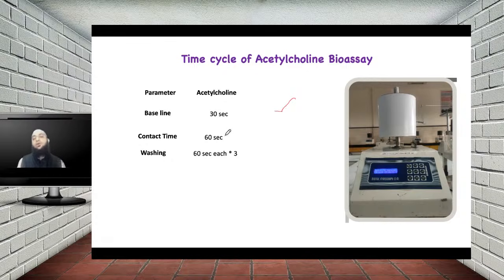Once that is over, you give the washing so that the drug can be removed from the site of administration, or removed from the receptor binding site. When you give the washing and the drug gets removed, and you are also putting that extra load down, due to that load and the washing the tissue will start relaxing, because the drug is now washed out from the receptor binding site, and the contraction that you got was due to the drug.